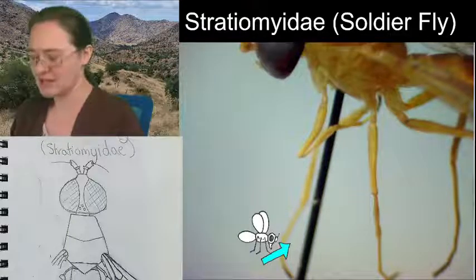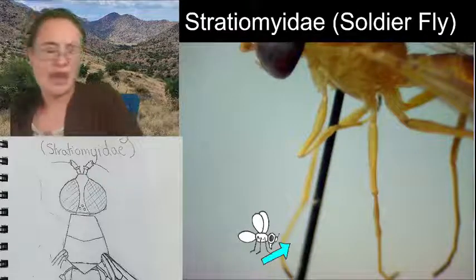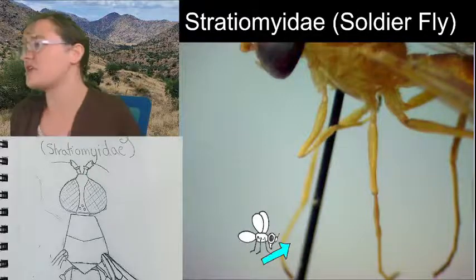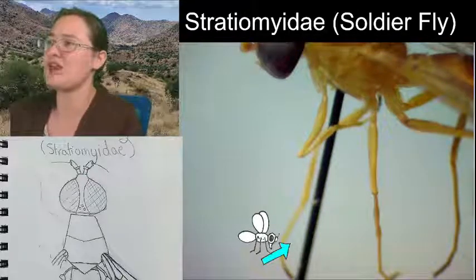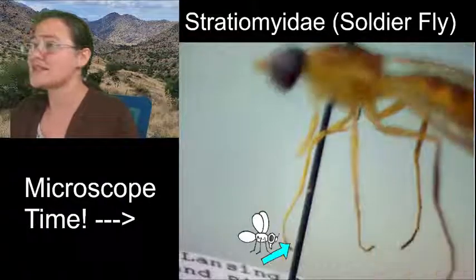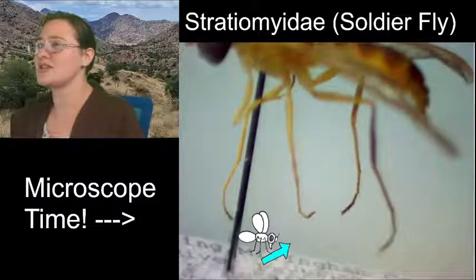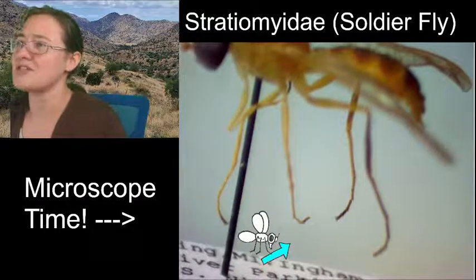You can't get your insect labels close up to the specimen if the legs are all dangling. If you mount a specimen properly, the legs should all be even, and these legs are not. But hey, I collected this one like a dozen years ago, so maybe I just didn't know any better at the time.